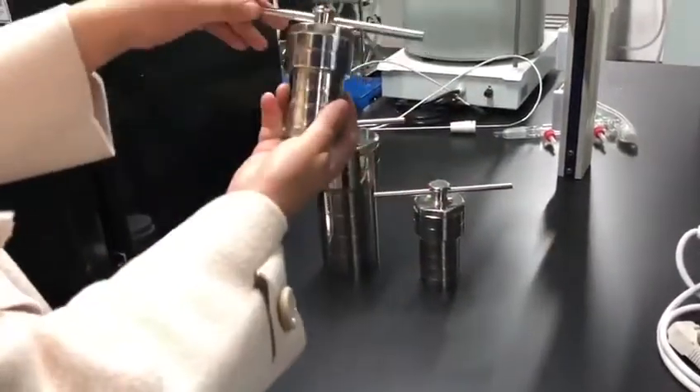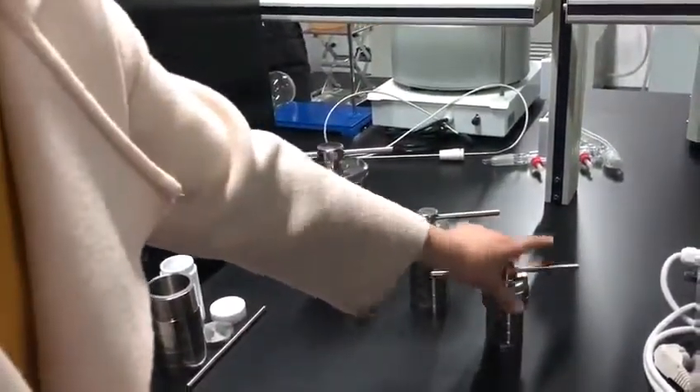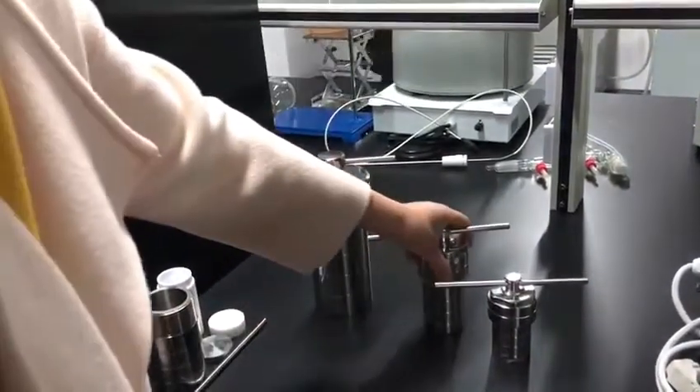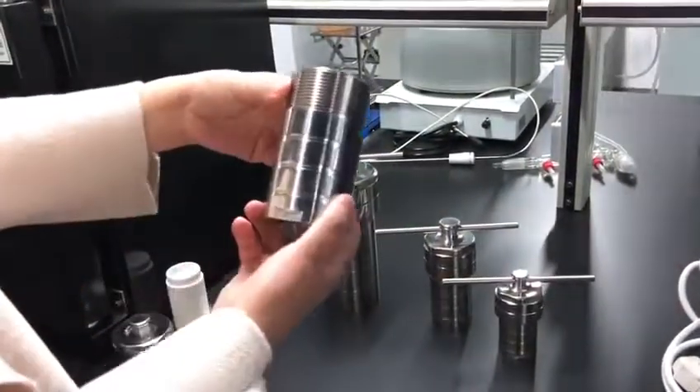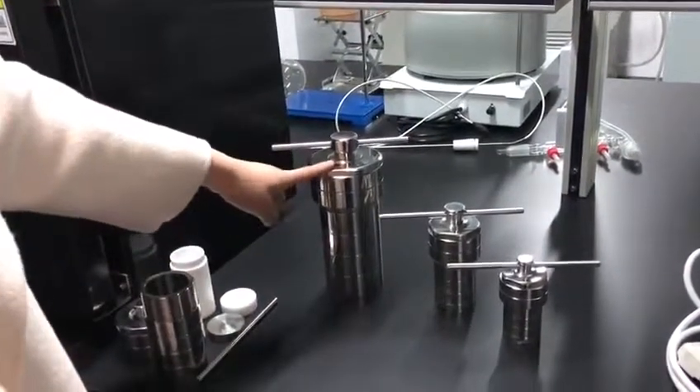This one is the smallest one — it's 25 milliliter. We also have 50, 100, and the big one, 500.